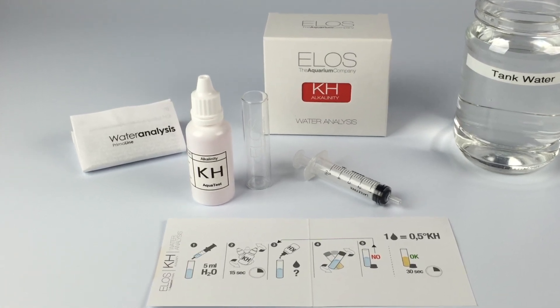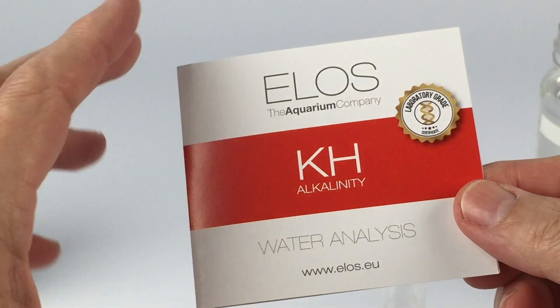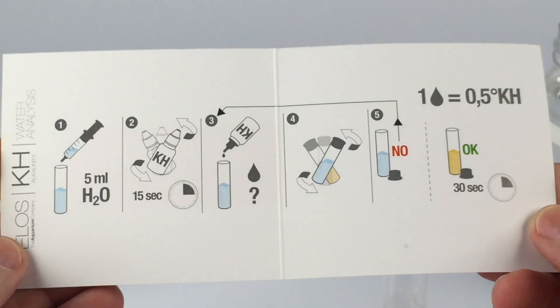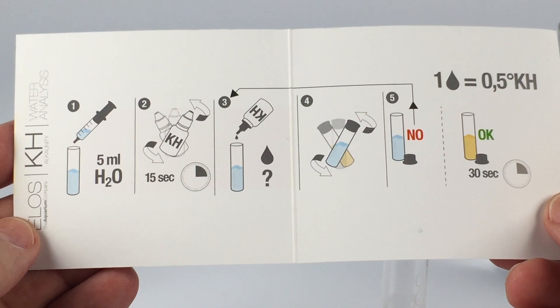This is the ELOS alkalinity test kit. These are the instructions that are included with each kit showing you exactly how much solution you'll be using.